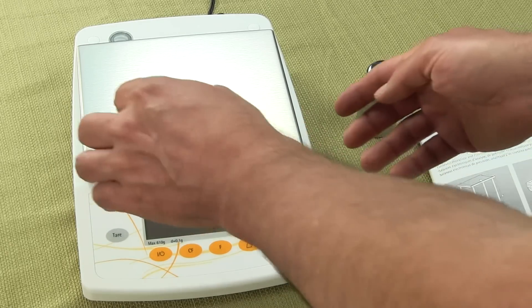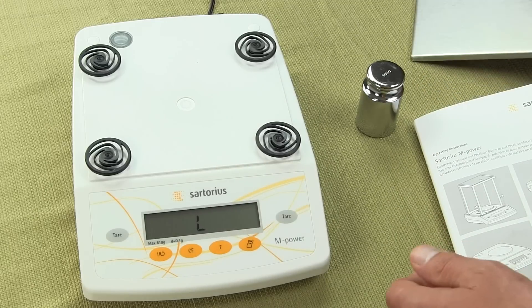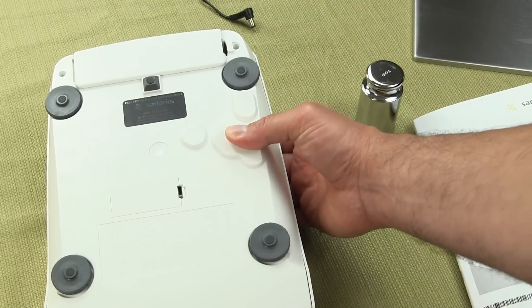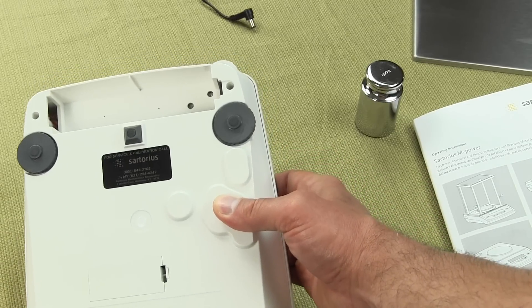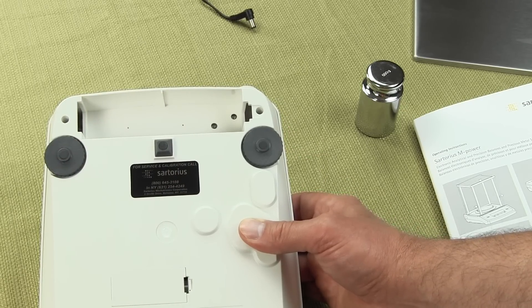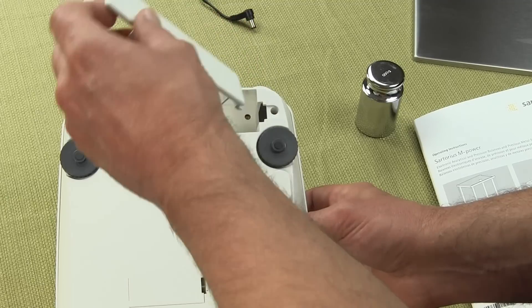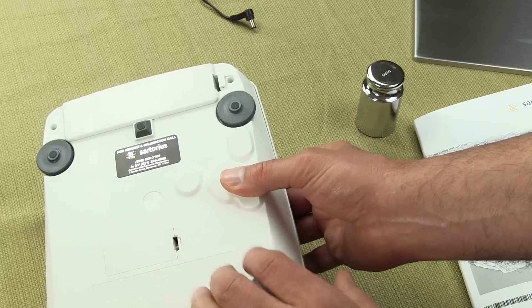Maybe in 2013 they will bring the feature back, but as of right now all AZ series are AC powered only. I want to show you on the back of this scale — the scale had a battery compartment right here. You will see that battery compartment, which would typically hold 6 or 8 AA batteries, has been removed. There is no battery carrier. So all AZ series now solely operate off of AC adapter. You'll see a lot of websites out there that say it operates off of batteries, but it doesn't.